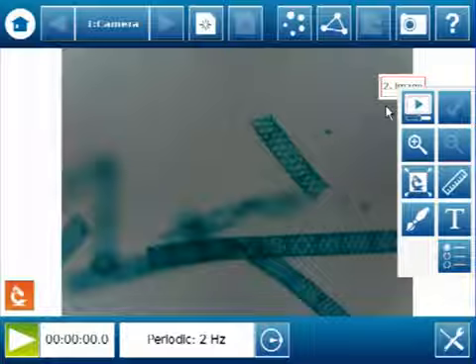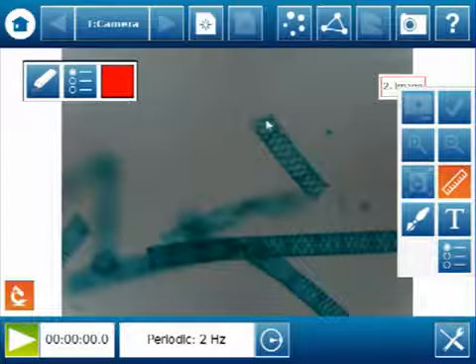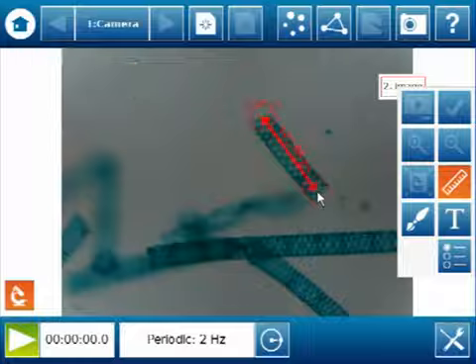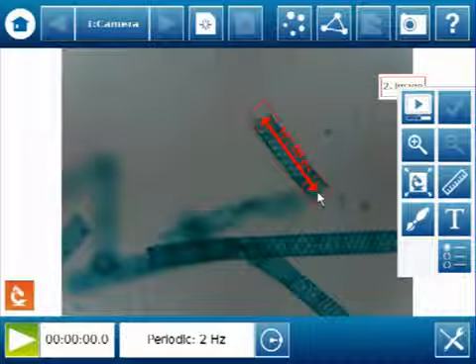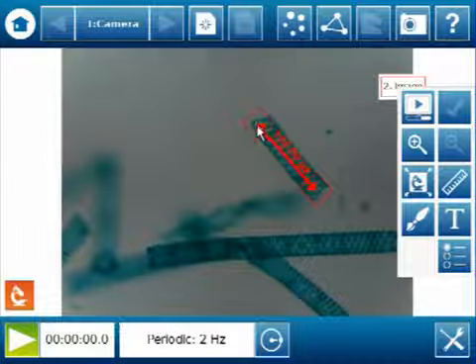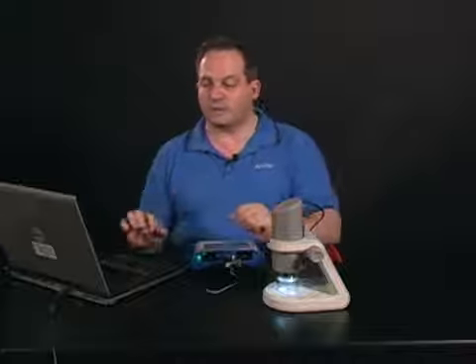And now I'm going to actually measure. So I'm going to use the measurement tool, and I'm going to touch 2 points on the screen, and it's going to create a measurement between those 2 points. And then if I wasn't quite where I wanted to be, I can use the handles at either end to move those measurements around and place them exactly where I want them on the image. So if I want the furthest points away here, I get a measurement of approximately 174 pixels, because that's the image space that we're working with.